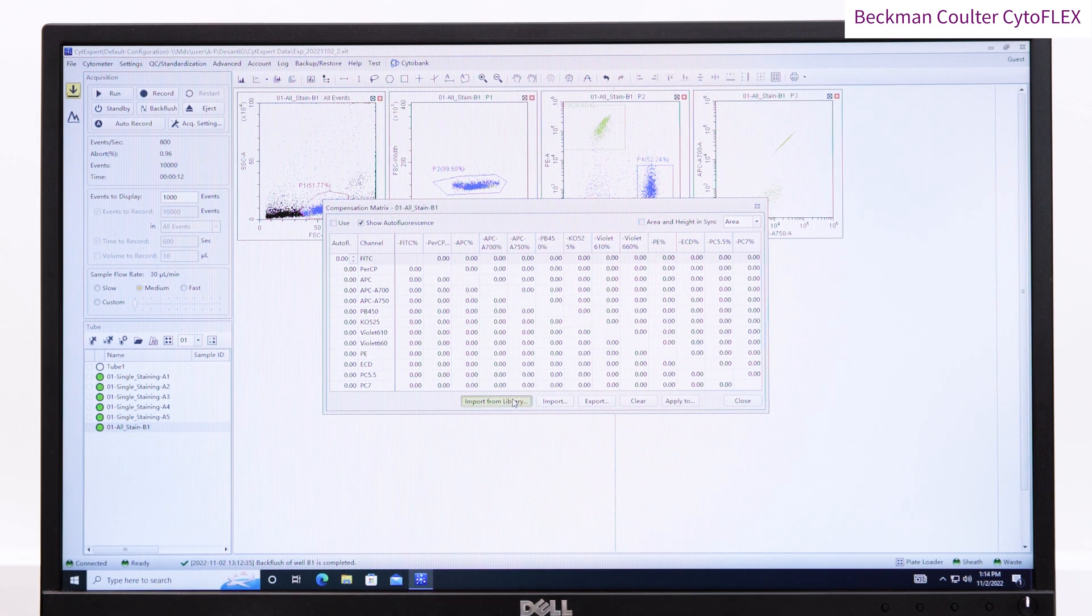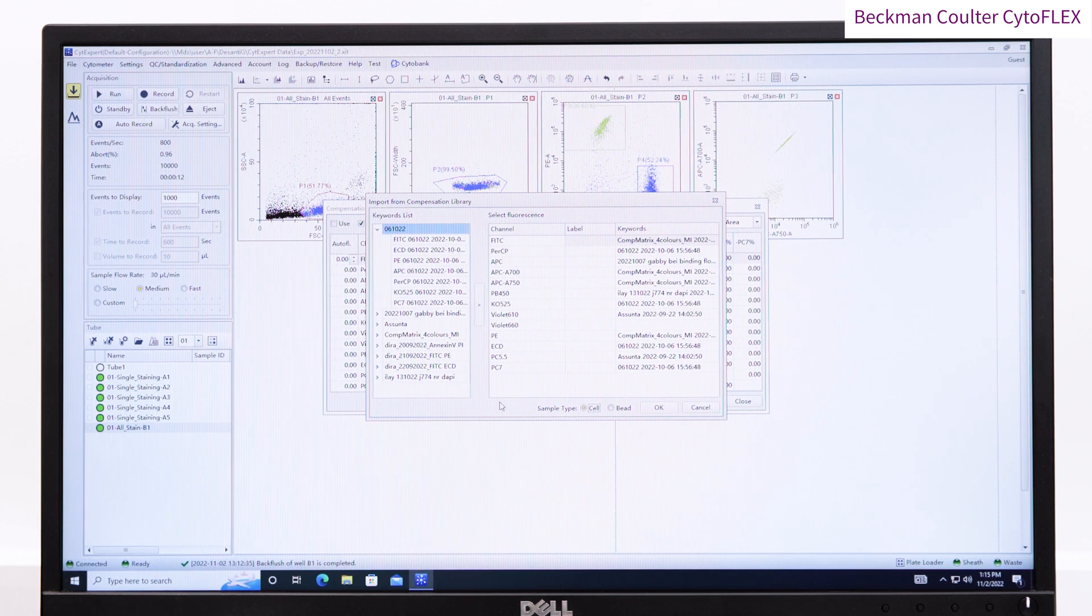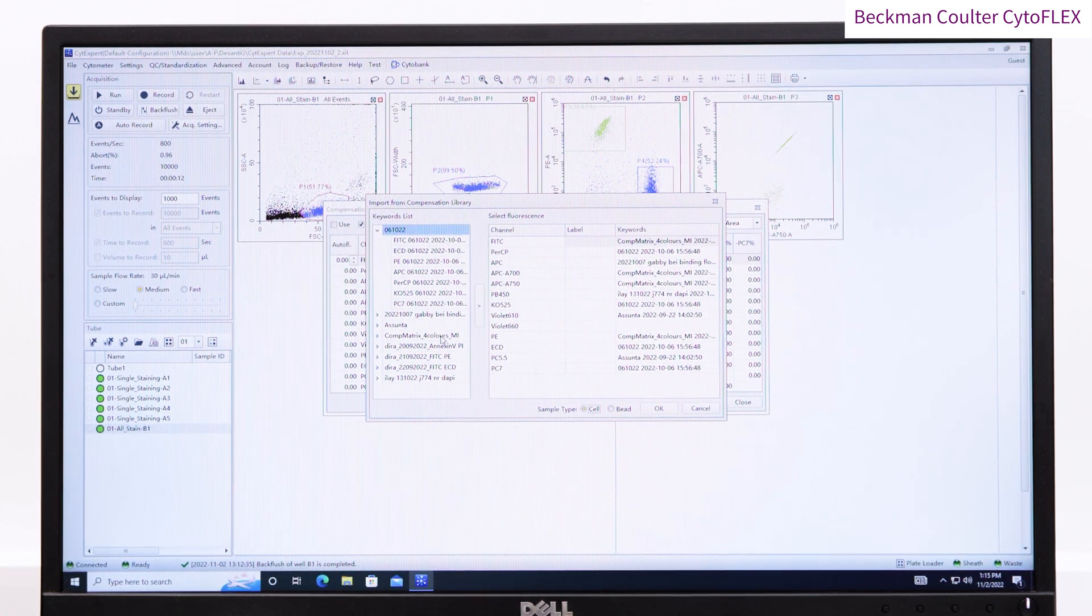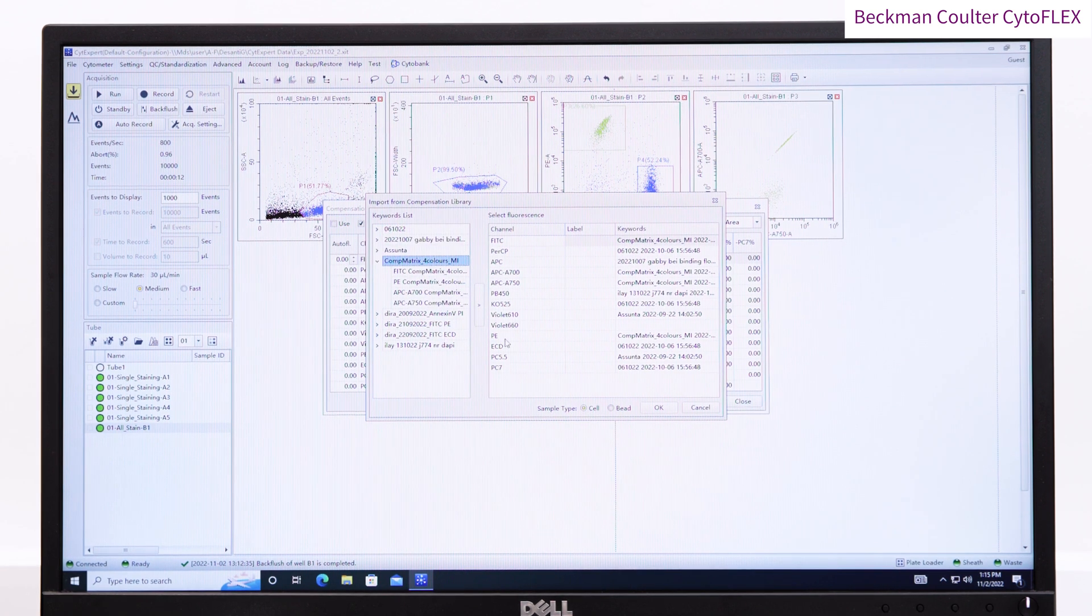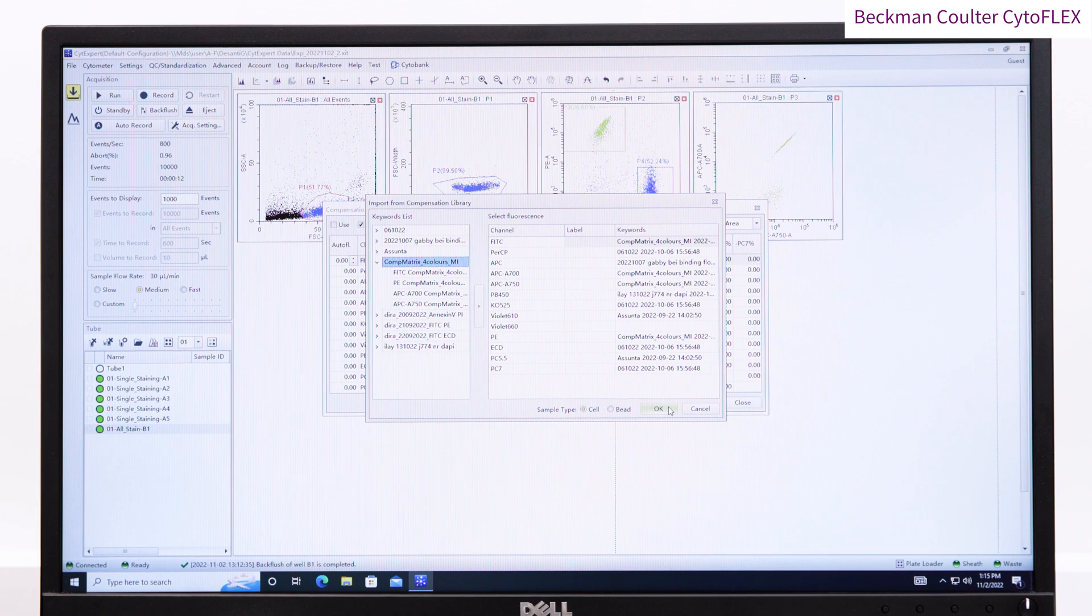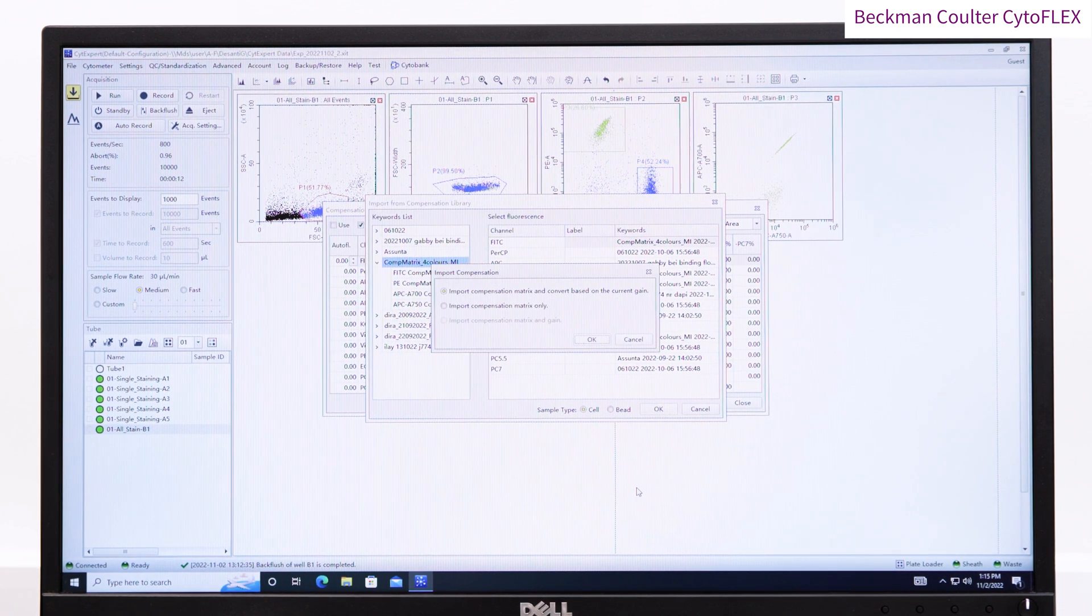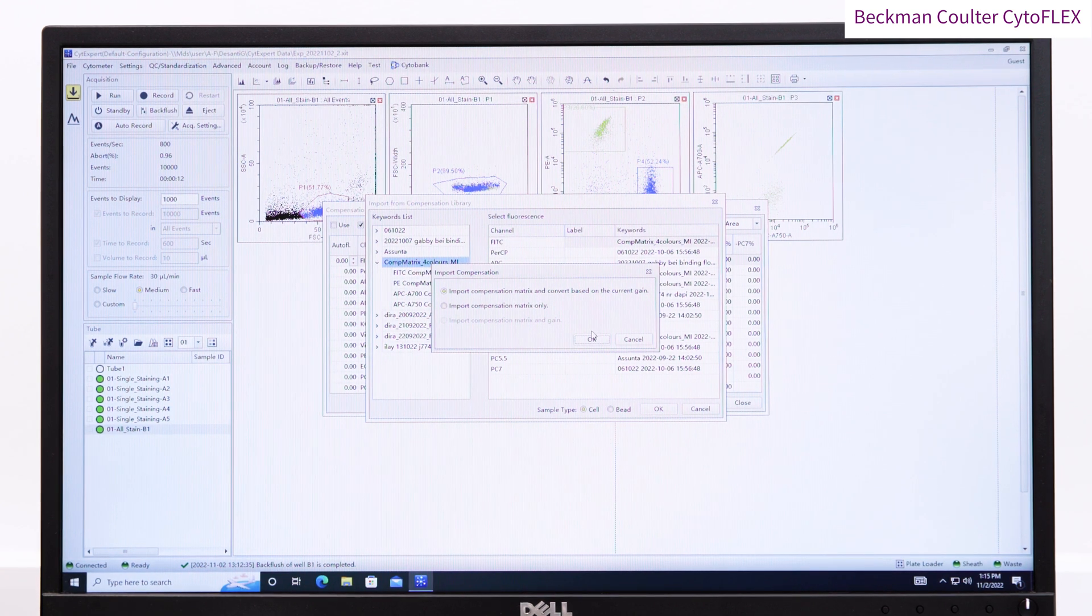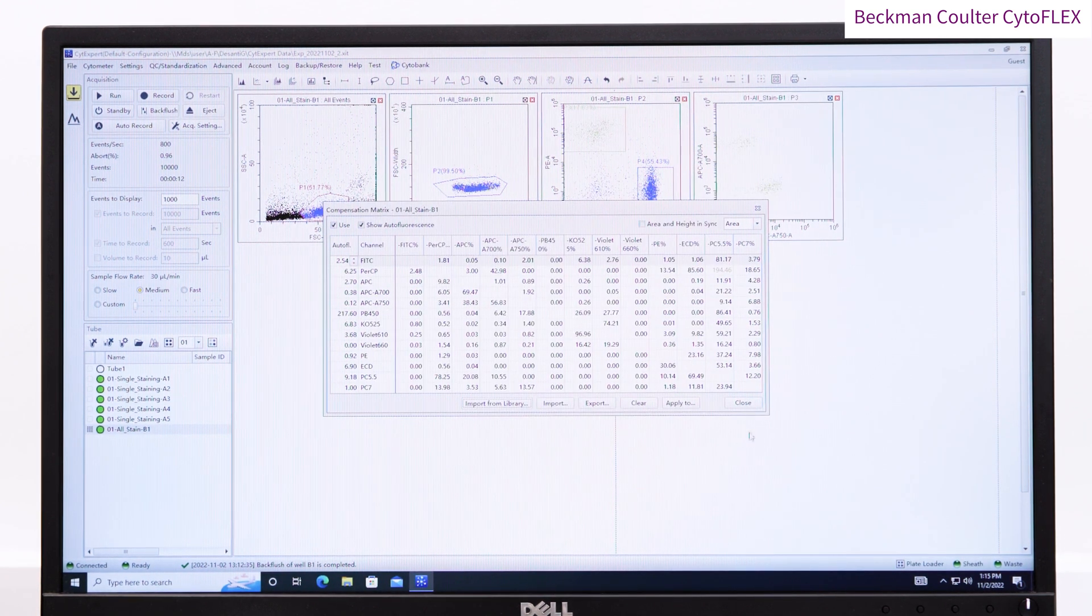If the compensation has already been calculated, then it can be loaded by pressing the compensation matrix button, and either choosing to import from file or library. Here I'm importing a compensation from the library. Press OK and the software will ask you if you want to adjust the compensation to correct for any differences in the gain settings between today's experiment and when the compensation was created. You almost always want to choose this option, so press OK.